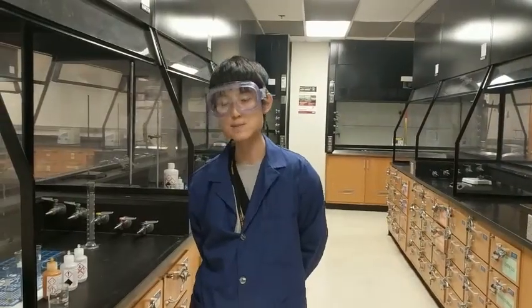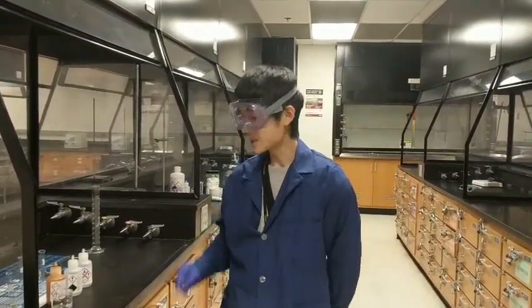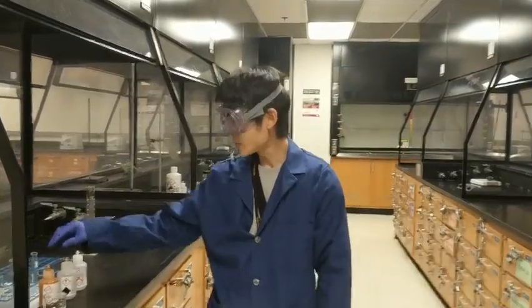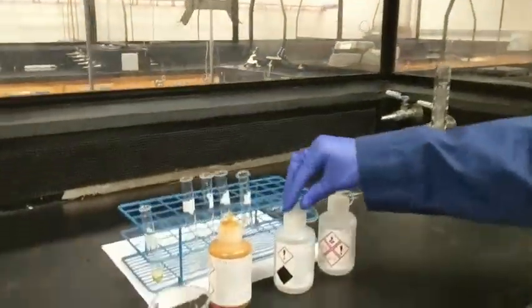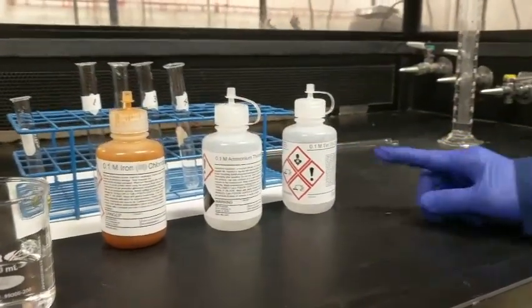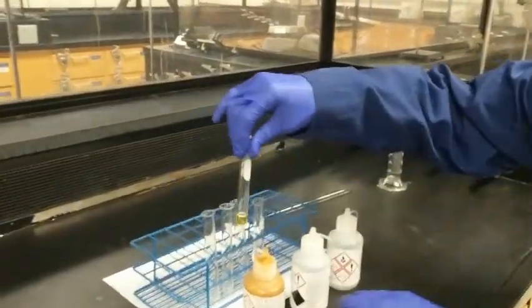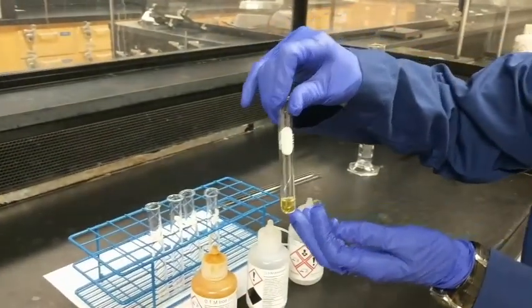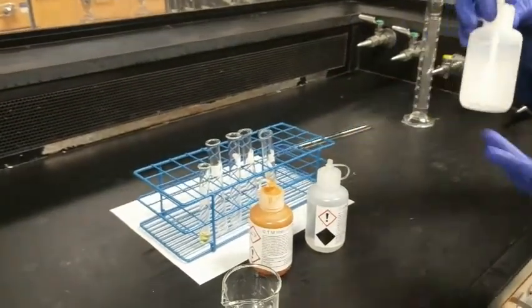In part 2 of the experiment, we are going to manipulate the formation of the metal complex iron thiocyanate by putting chemical species or ions into the equilibrium system. So first we have 0.1 molar iron(III) chloride, 0.1 molar ammonium thiocyanate, and 0.1 molar tin(II) chloride solution. Only the iron(III) chloride solution has a yellow color, and the other solutions are colorless. Alright?